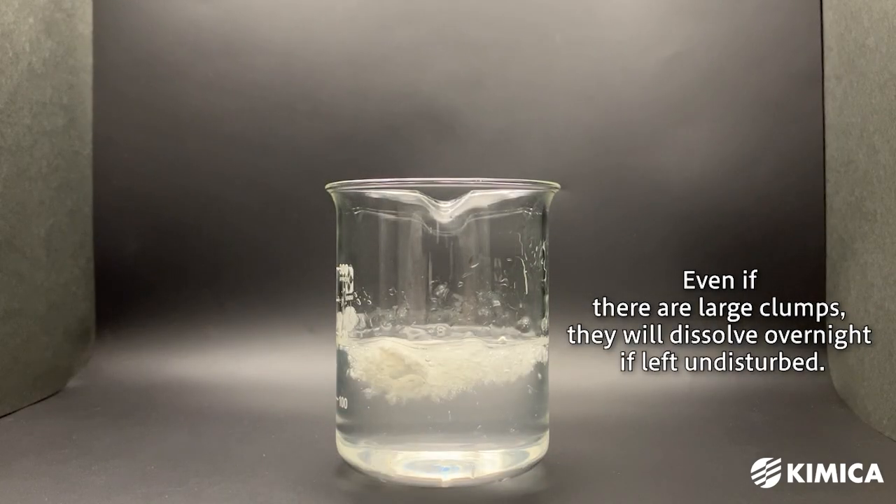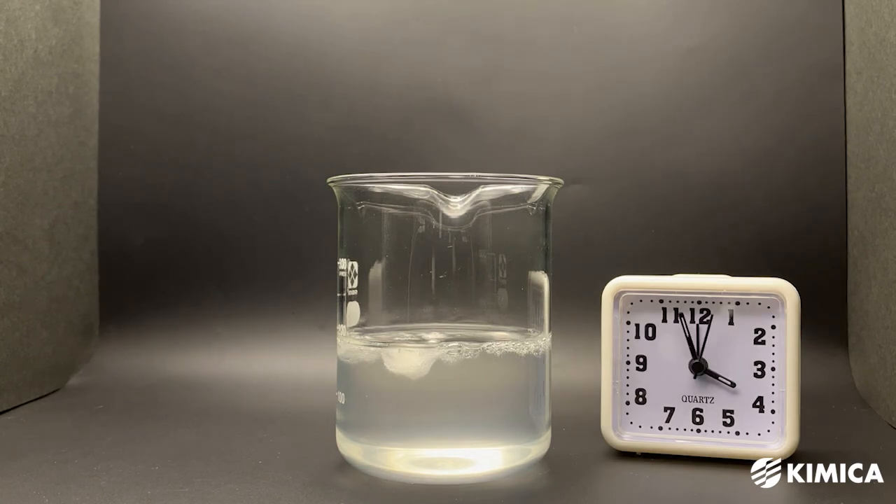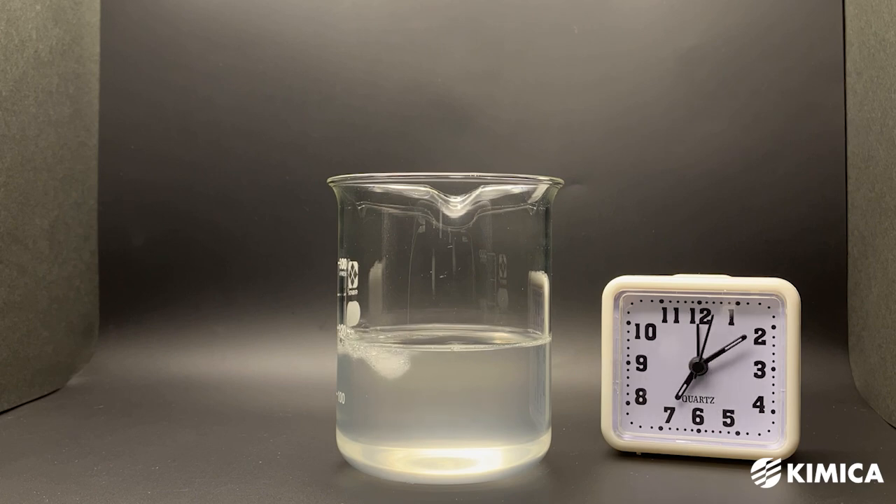Even if large clumps form initially, let the mixture sit overnight. The alginate will gradually swell and dissolve. If you have enough time, this method, which doesn't require dissolution equipment or dispersing agents, can be considered the simplest way to dissolve alginate.